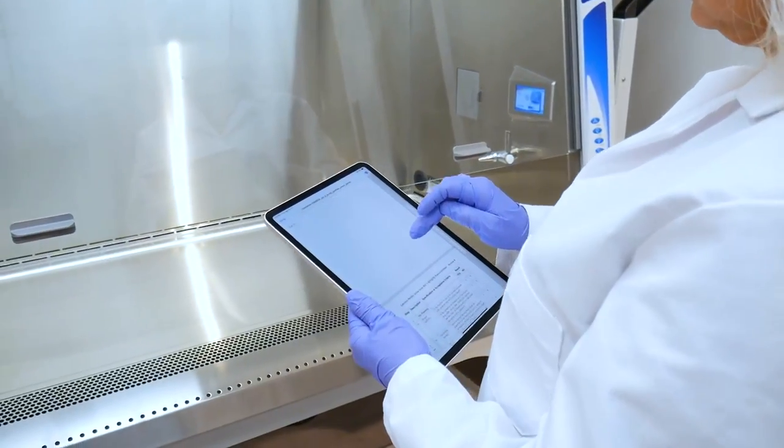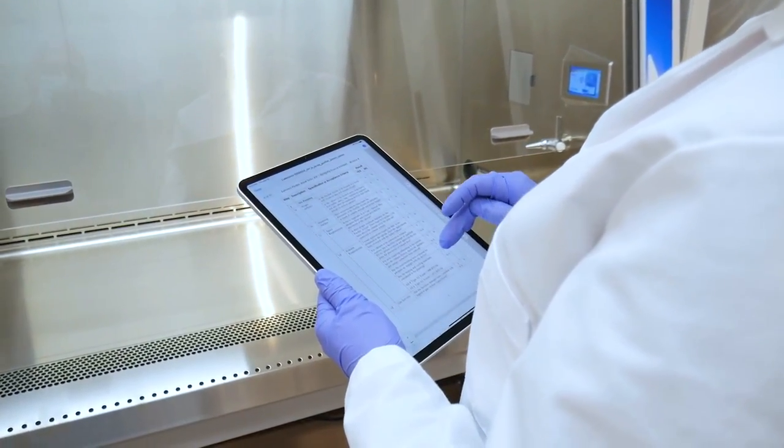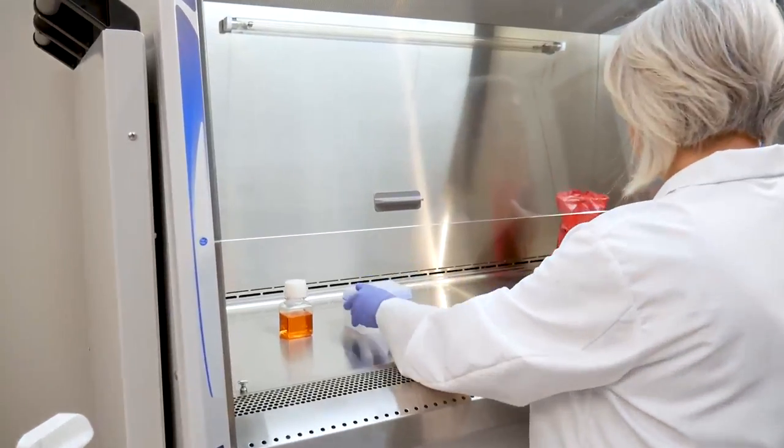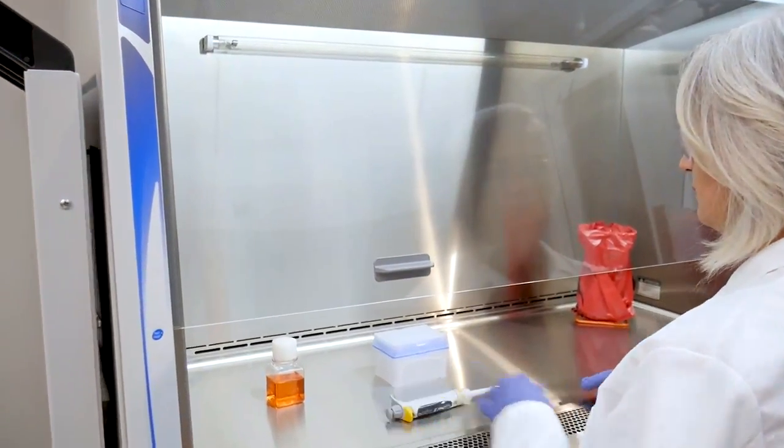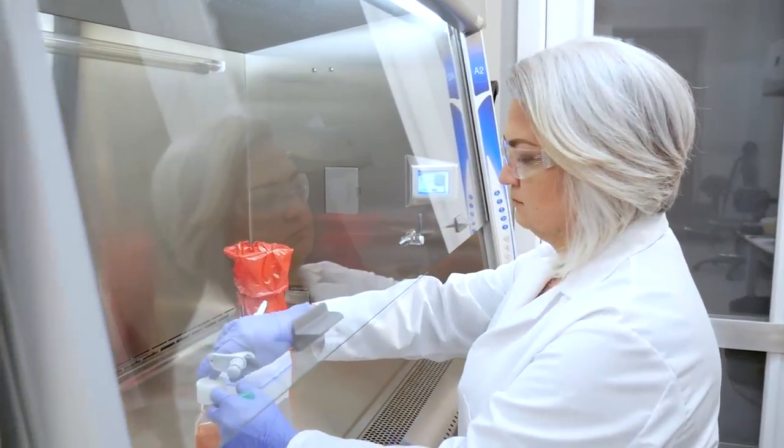However, it is critical that you fully understand how your BSC works and how you should work within the BSC to ensure the safety of yourself and your samples.